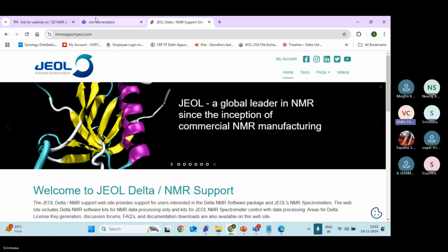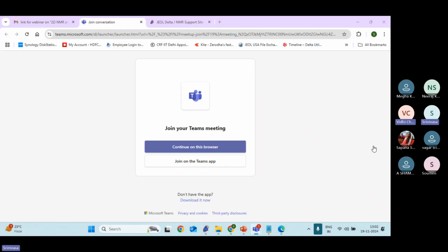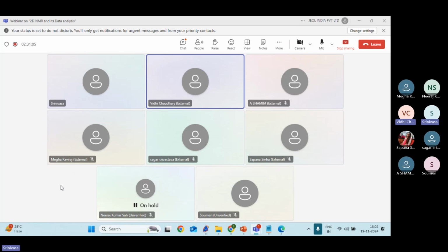If she asks for this experiment, we will call you online. Yeah, that's better, I can. Because I think previously we have not done that kind of experiment. Correct. WaterLOGSY is not done, and if you want any experiment like that, let me know, ma'am.